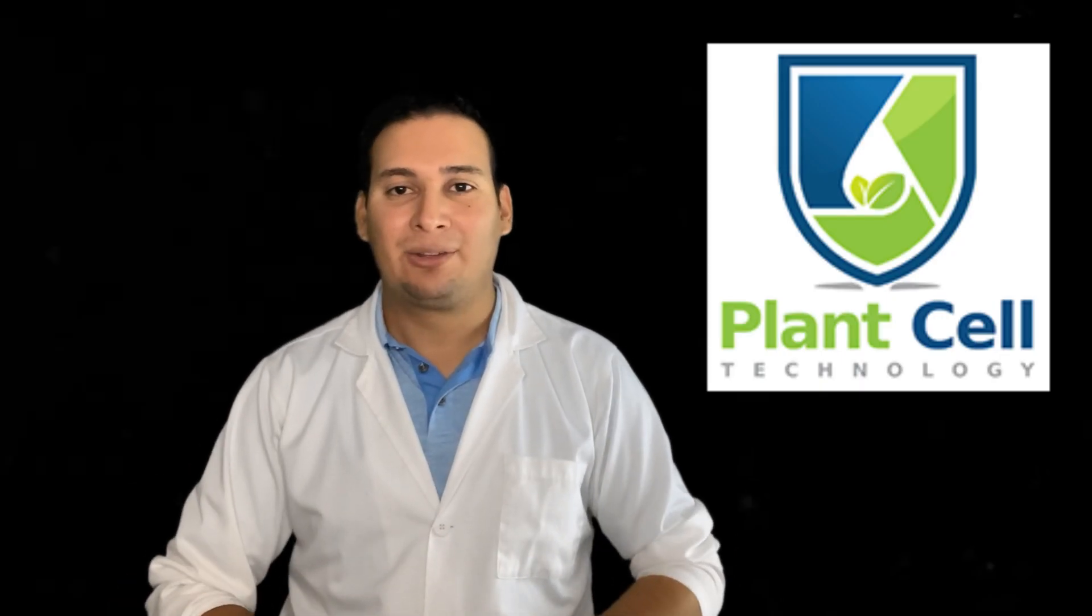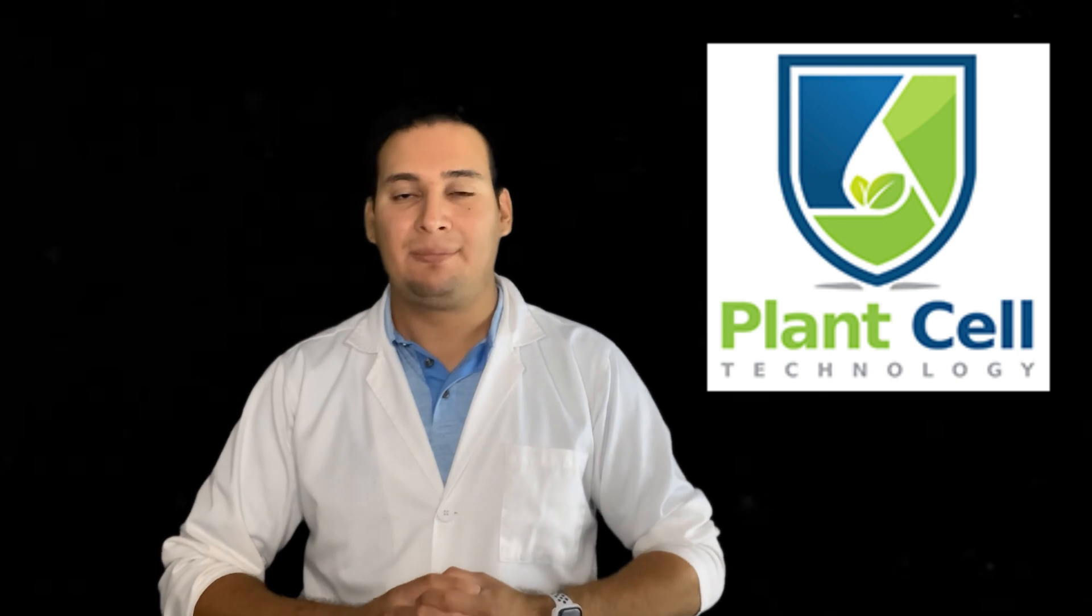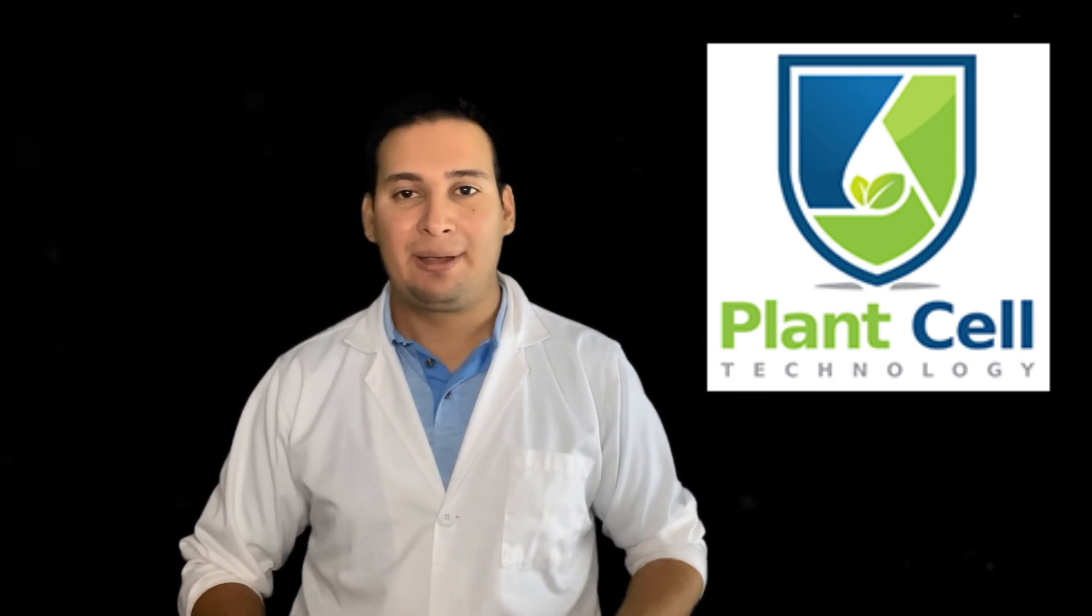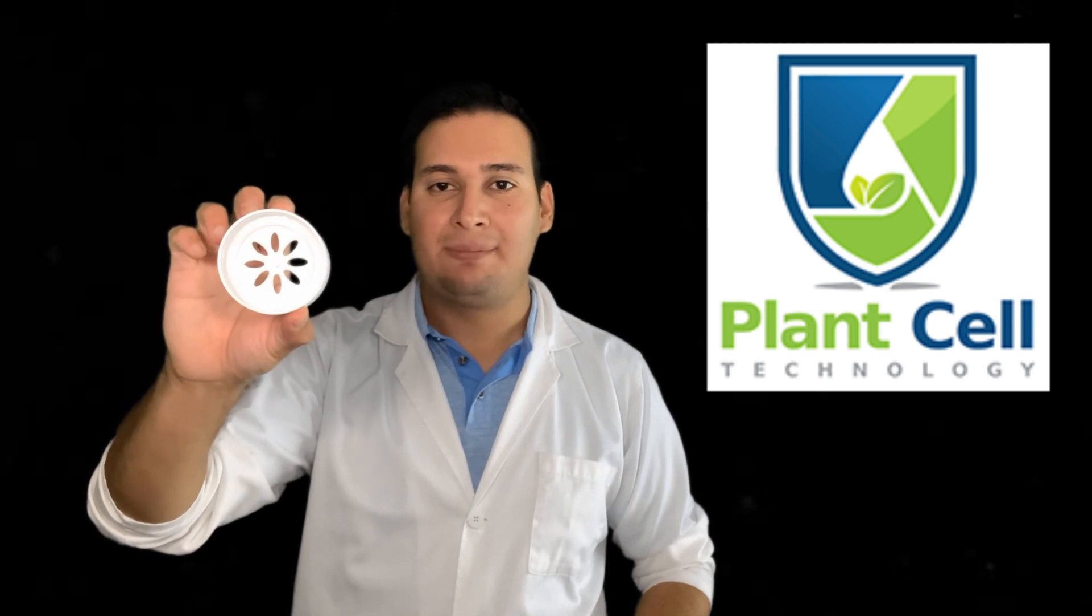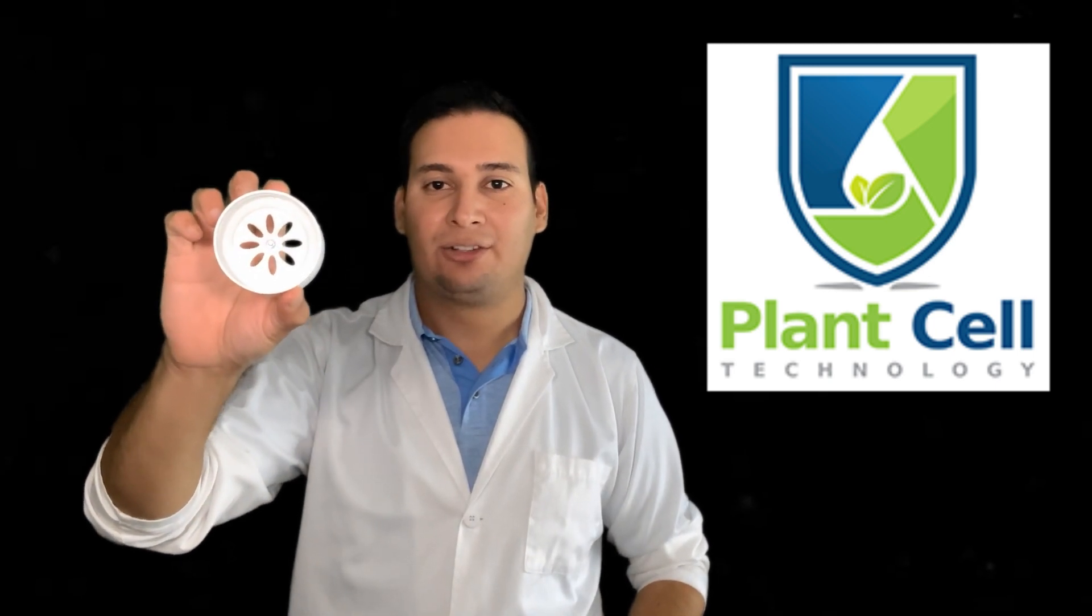What is going on guys? Welcome back to another video. On the name of everybody behind PlantCell Technology, I'm very excited to introduce you to this. This is the biocoupler TM Temporary Immersion Bioreactor. So let's take a look.